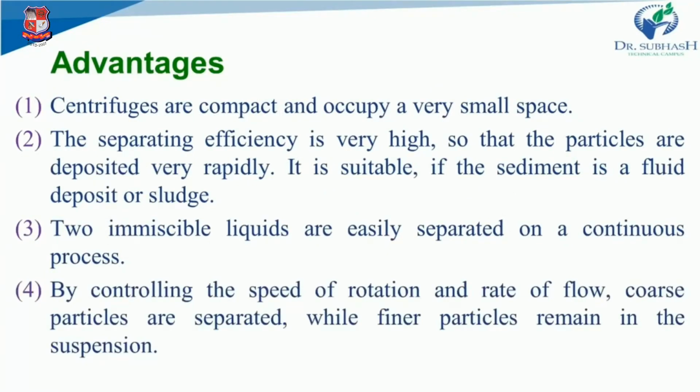By controlling the speed of rotation and rate of flow, coarse particles are separated while finer particles remain in the suspension. When you control the speed of rotation and rate of flow, you can easily separate the particles that are a little bit big in size, while finer particles remain in the suspension.